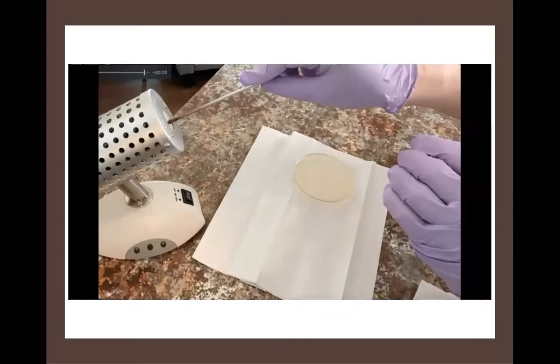So essentially what I've done is I took a bunch of cells out of the culture tube, the broth, and I placed them onto the first place that I hit on that agar. I put a large number of cells onto the surface. And then by sliding my loop across the surface, back and forth, I'm spreading those cells across the surface of the plate, so that I'm giving them room to grow on that nice nutrient-rich solid media. Let's take a look at that again.